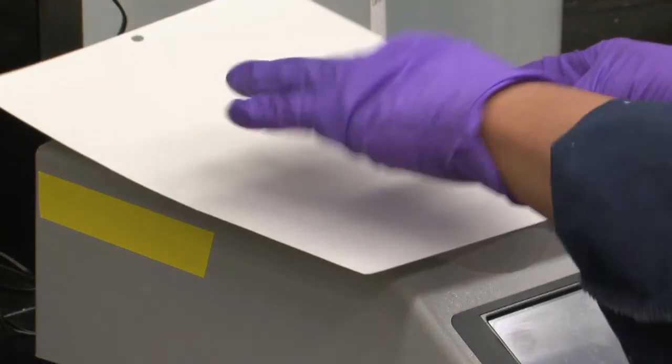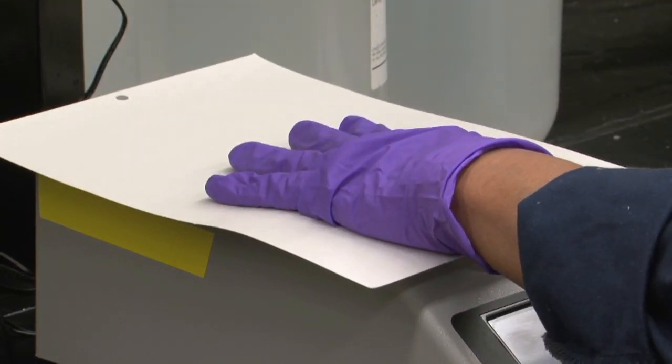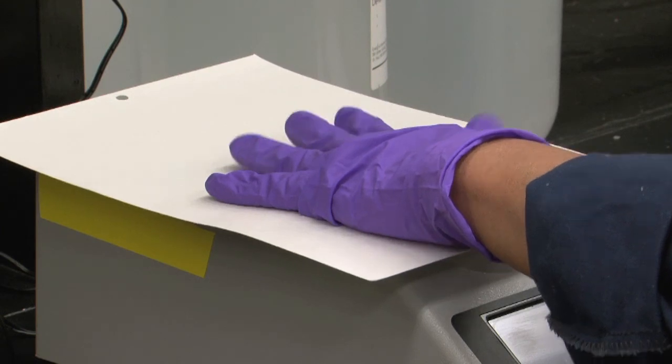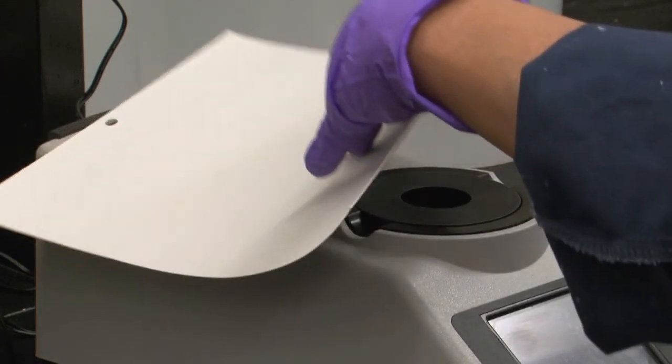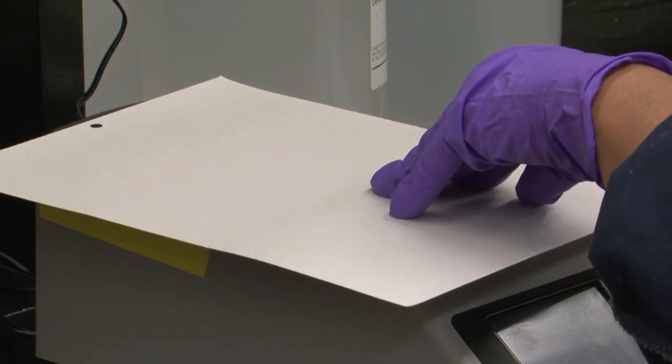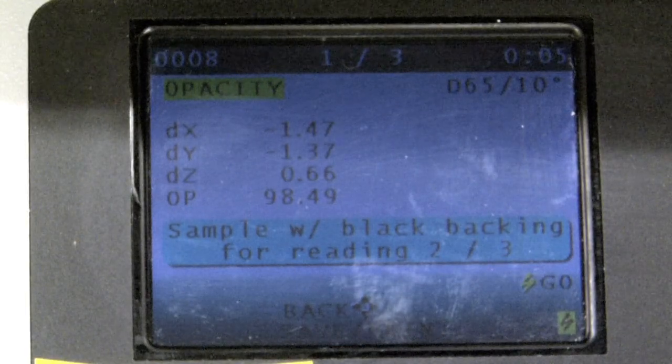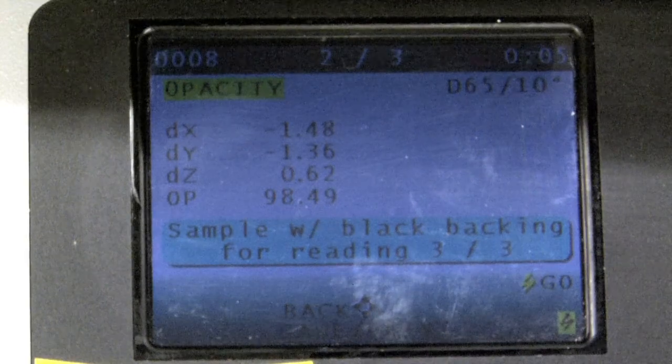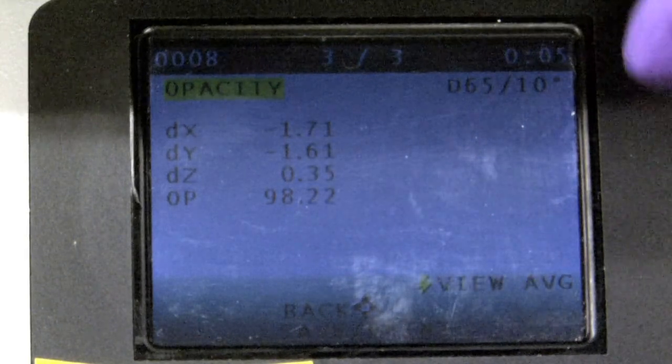We then use a tri-stimulus colorimeter to measure color difference by means of reflected light. We measure the opacity of several points across the paint, covering both the white and black areas. Then we compare the average values from both areas to find the gradient of difference between them.